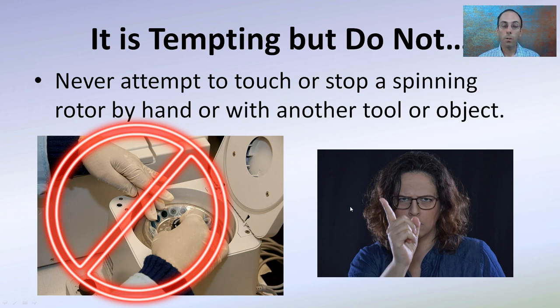At the end, whenever it's done, it's tempting, but do not attempt to touch or stop the spinning rotor by hand or with another tool or object. A lot of times the timer might go off and you want to grab it with your hands to stop it — you want to avoid this at all costs. It could be spinning at a very fast rate. Let it slow down naturally, because putting pressure on one area could damage the rotor or catch your finger on one of the tubes.